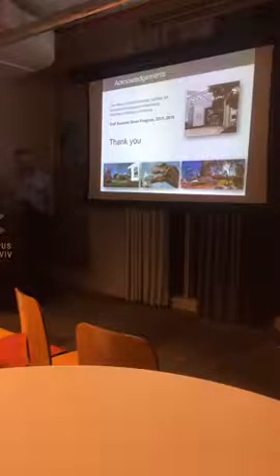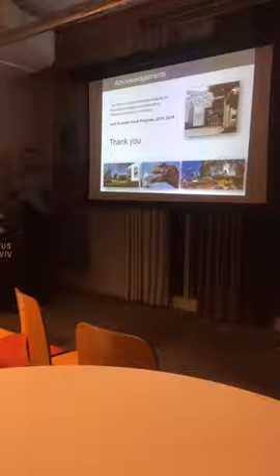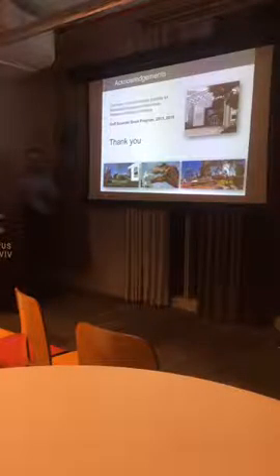There's Andrew Dunn, also David Boas, that I mentioned. When I started, it was 10 years ago. Now it is becoming a more common and robust method, laser speckle. But most of the people don't combine it with anything else.